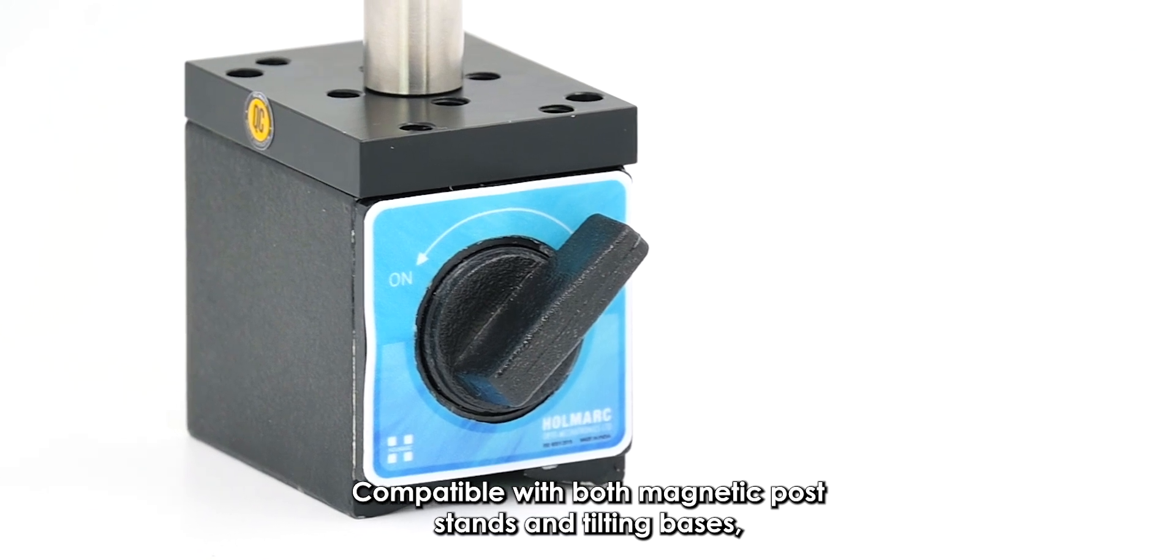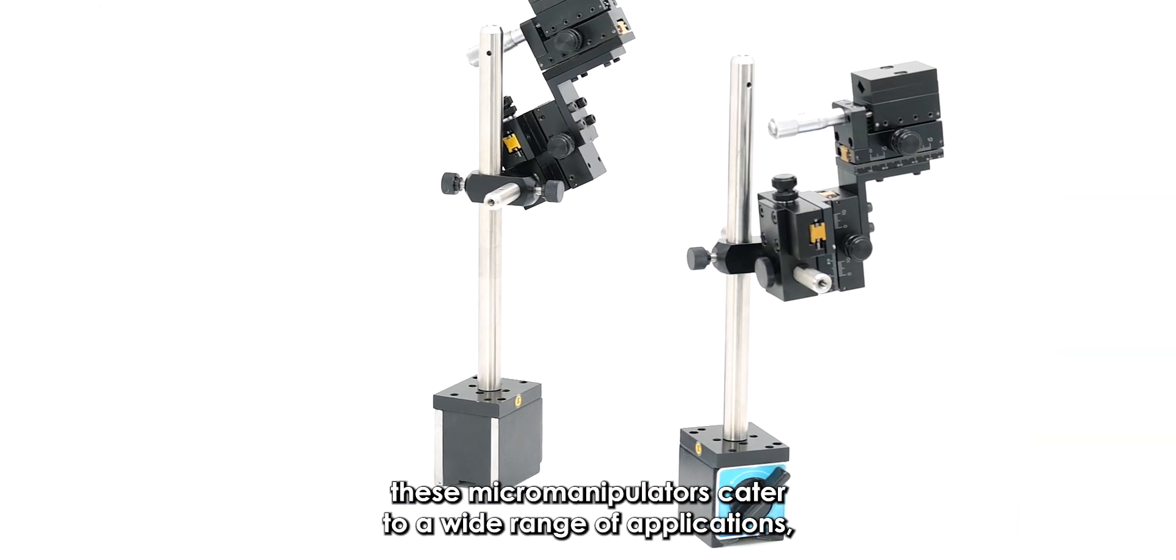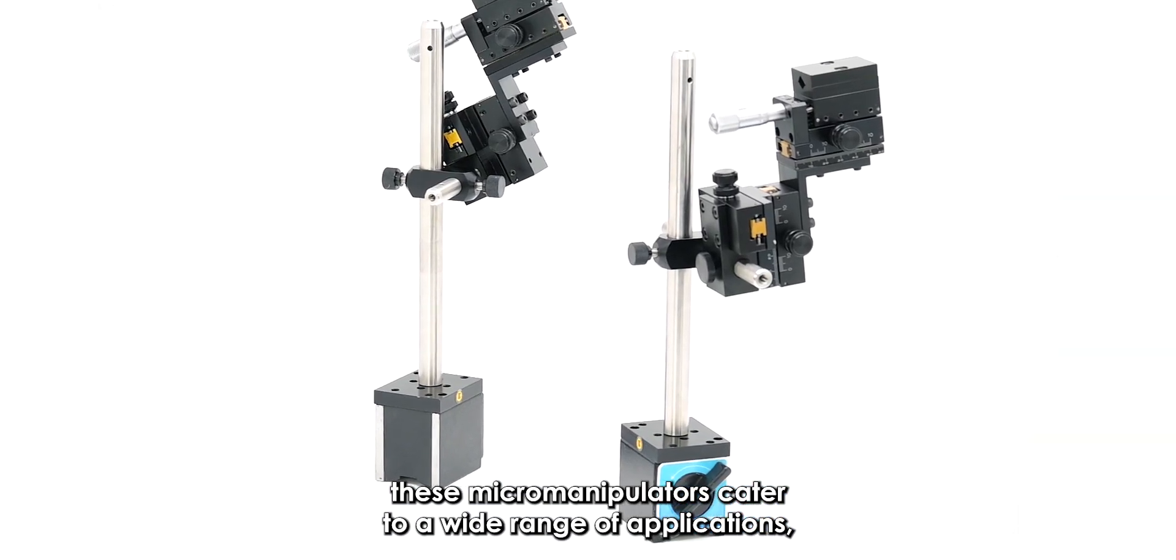Compatible with both magnetic post stands and tilting bases, these micro manipulators cater to a wide range of applications.